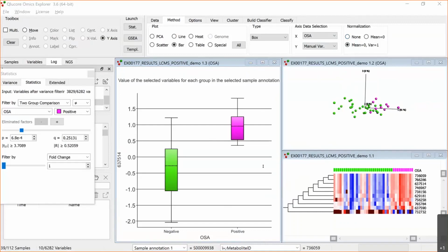And a question here: should we call it normalized protein expression? Now, I'm not sure what the correct term is. So this is a mathematical normalization that we do. So I guess that would be correct. But then, of course, we also talk about the platform-specific normalization. So it's important to distinguish between those two normalizations.